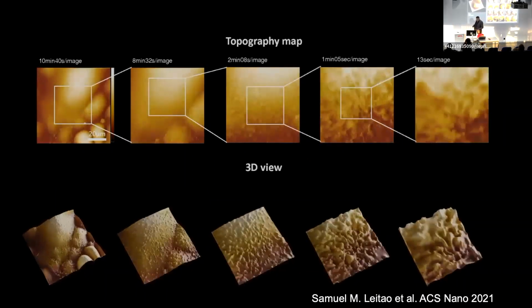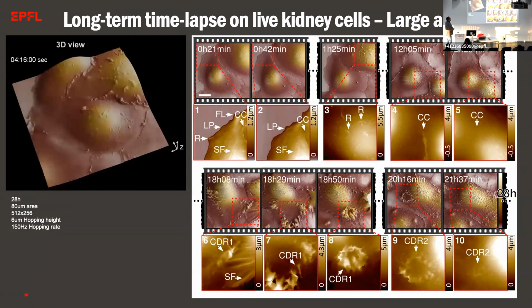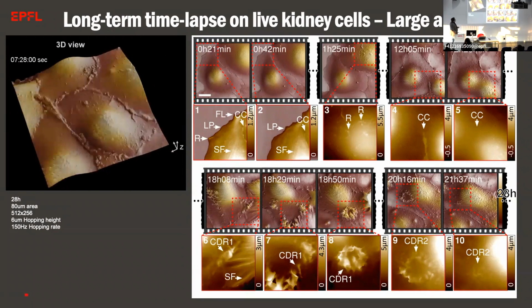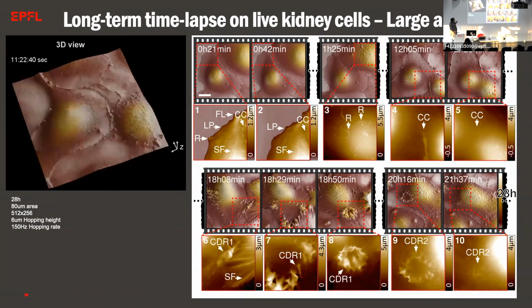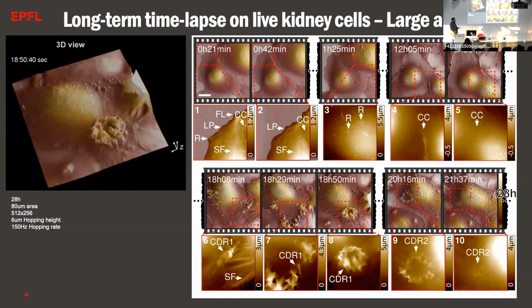And what we can do with that now is to really start to look at the living cells in the native environment without bothering them too much, without distorting them, and observing them for a long period of time. And I'm not going to go at all into the science here. I just want you to look at these images, because for me, maybe I'm just biased here, they were showing cells in a way that I had never seen them before.